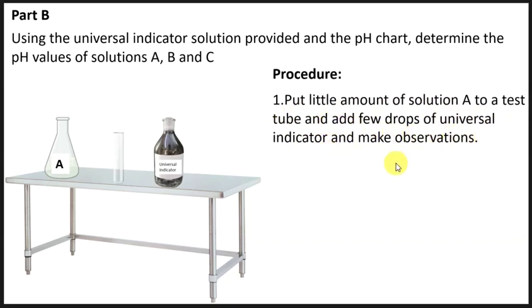So what we are going to do here, we are told to put solution A to a test tube. Put little amount of solution A to a test tube. So we'll use a dropper, then pick solution A and then put it to a test tube there.